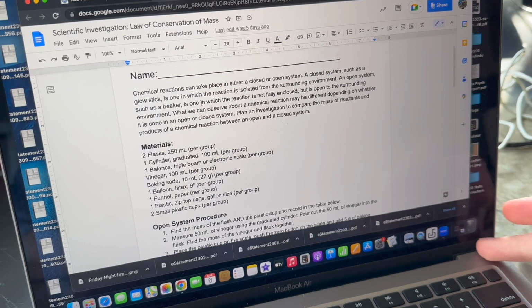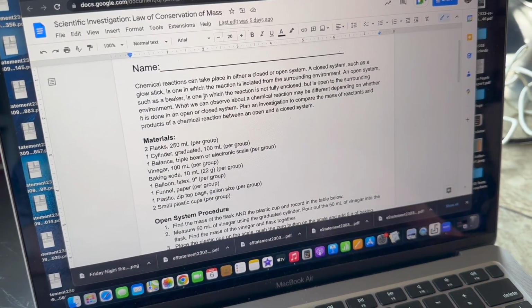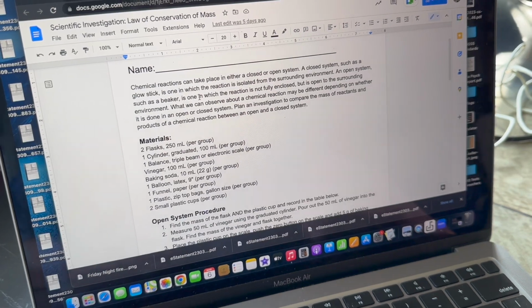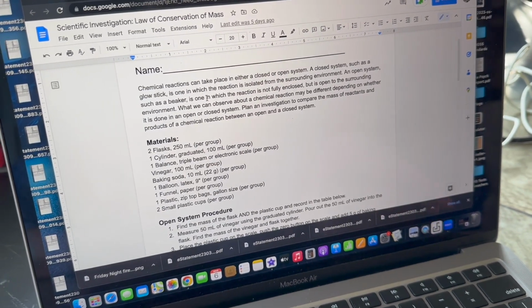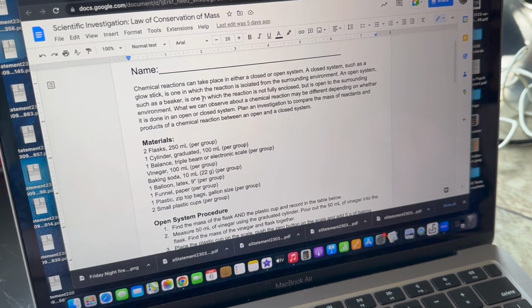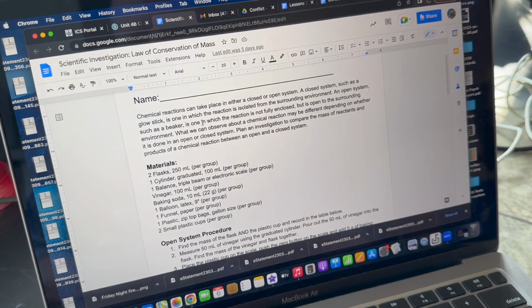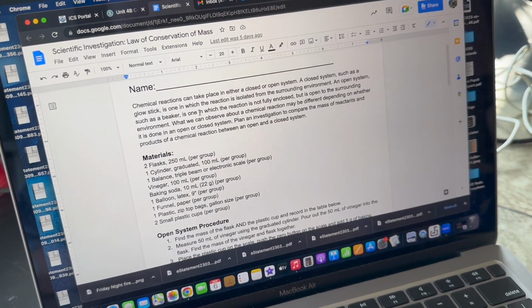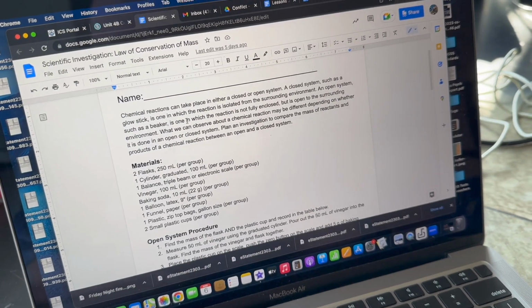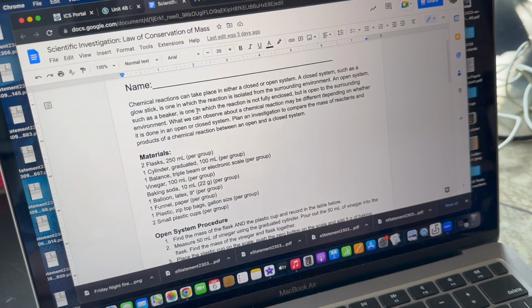He studied a chemical change in a closed system, and he noticed that if all the conditions were right, the mass remained unchanged before and after the reaction. So we are going to do our very best to create a closed system. It's very, very difficult. I think by the end of this, you'll realize how difficult it is, but we'll see if we can do it.